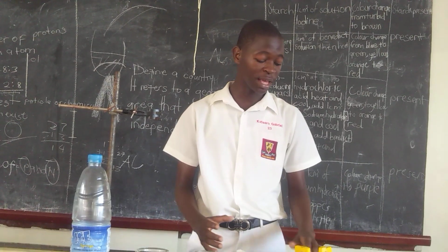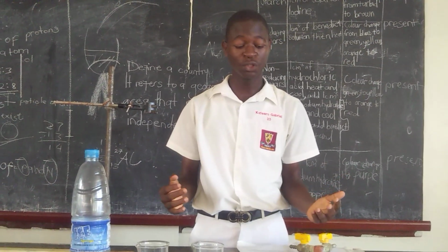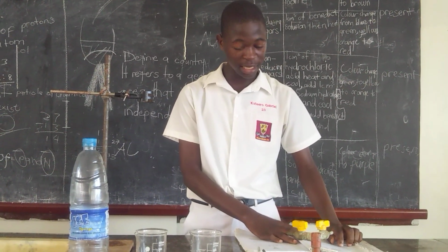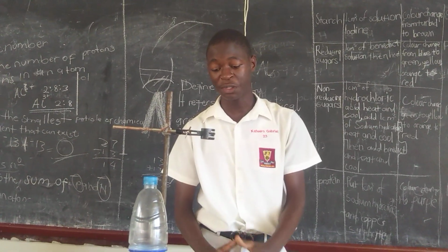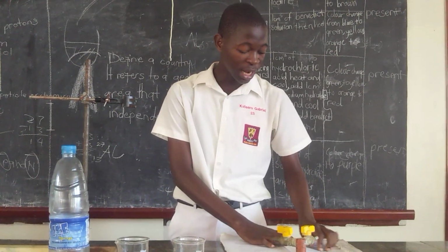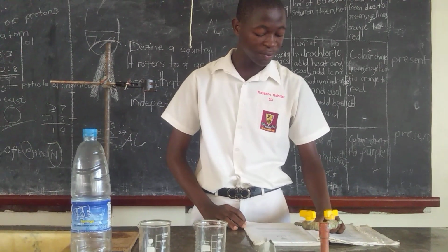They can be separated in whatever proportion. They form distinct layers. As we do our experiment, you will see the different layers involved. That's what they are saying here in our textbooks: such liquids form distinct layers because they have different densities.